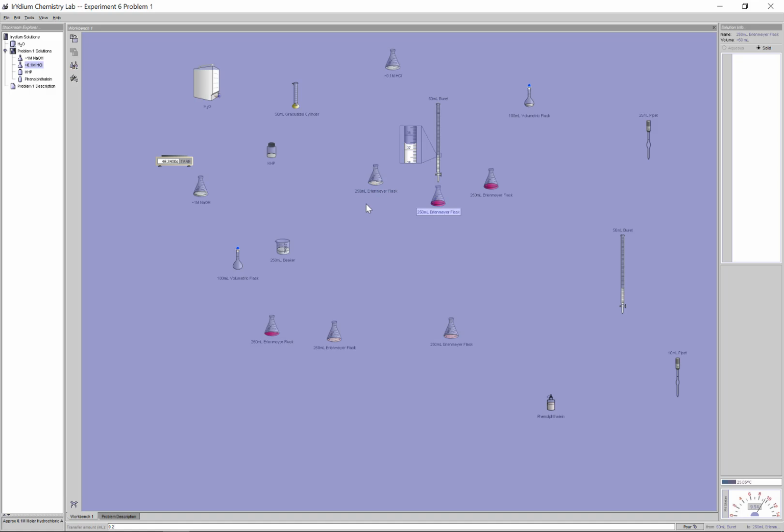I'm hoping once I get the average volume, I'll be able to get the concentration really well. So let's just reload the burette again using my diluted NaOH solution here. Right now we're at about 36, so I'm going to add in maybe 34.